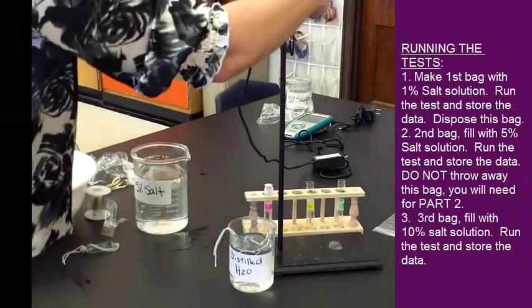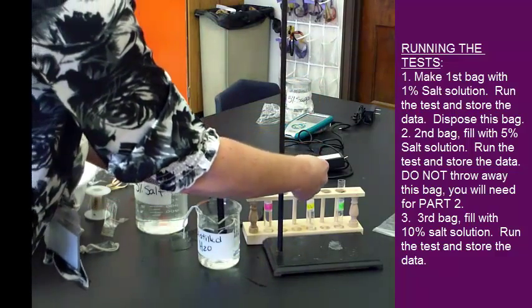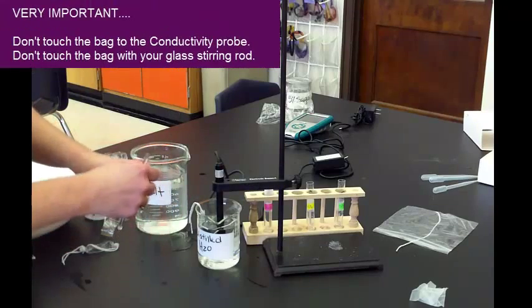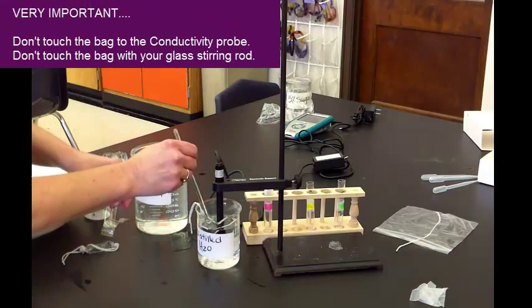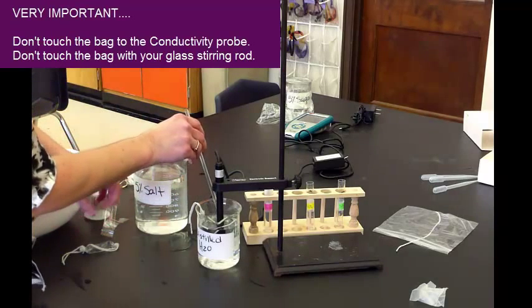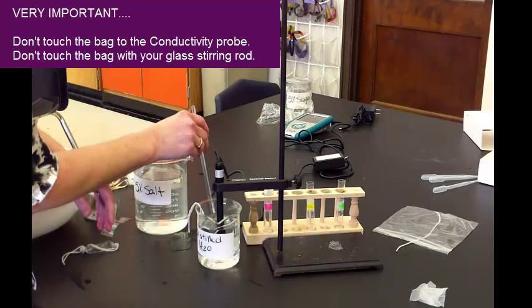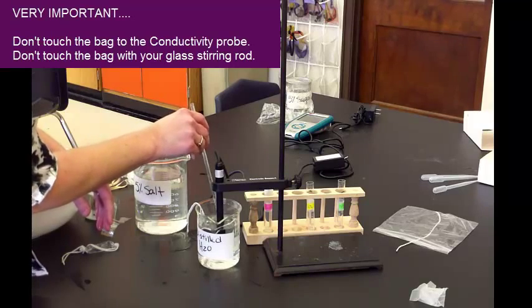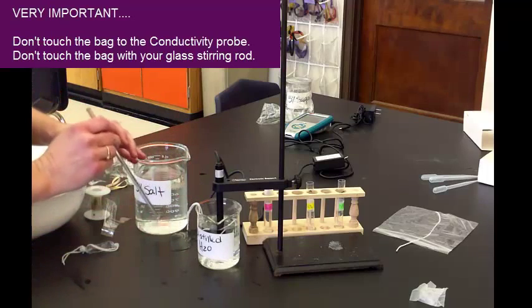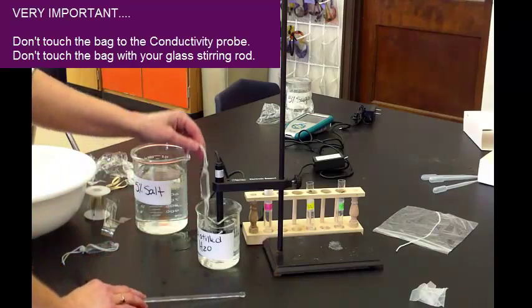So I've got my conductivity probe. I'm going to lower it into the water. Don't make the bag until you're ready to collect the data. Now, here's the important part. Take your stirring rod. If you poke the bag, and you see a spike on your graph, which is on your LabQuest, that means you touch the bag, and you push the ions out. So, you just want to make a little current, and just kind of move it or wiggle it around, but don't touch the bag. Make sure the bag is not touching the probe, and it's run for a certain amount of time, and then you stop it, and then we are finished.